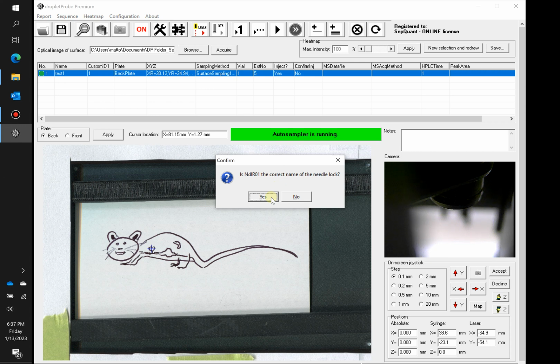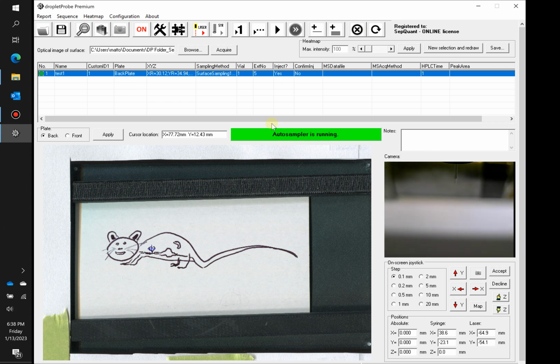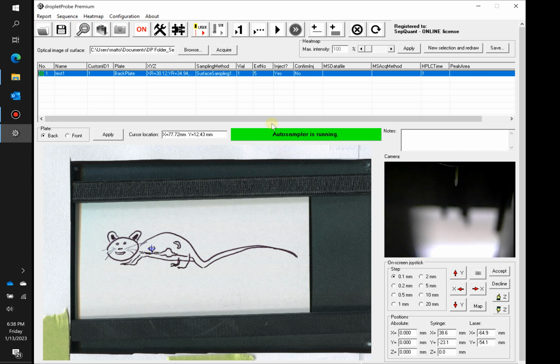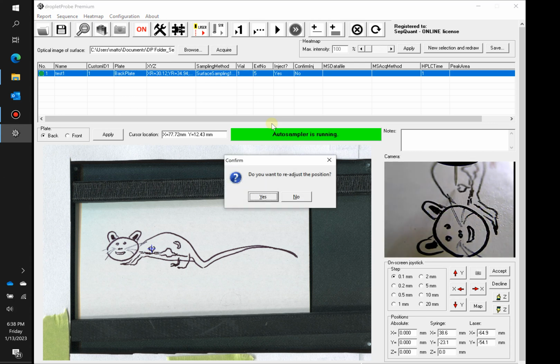The needle guide locking message that you just saw is basically so that as this is moving, you could imagine if you had a micro junction with the lower needle guide in the down position, you potentially could run the risk of wicking up that extraction solvent onto the lower needle guide, and that's obviously not good.